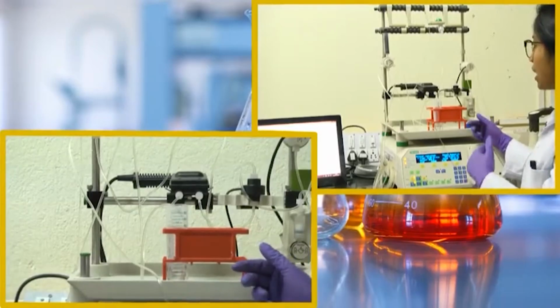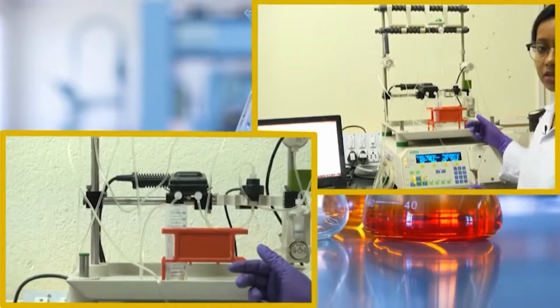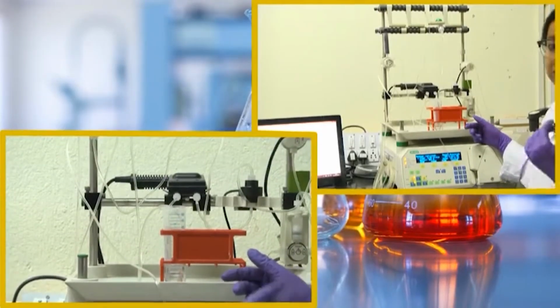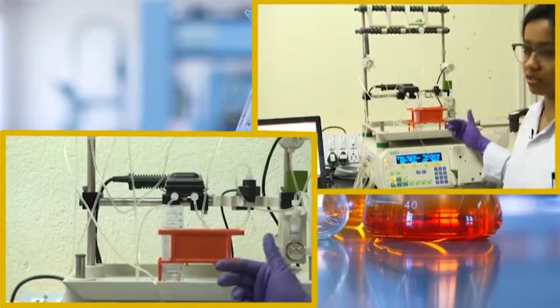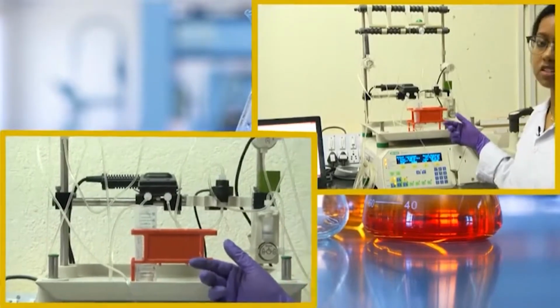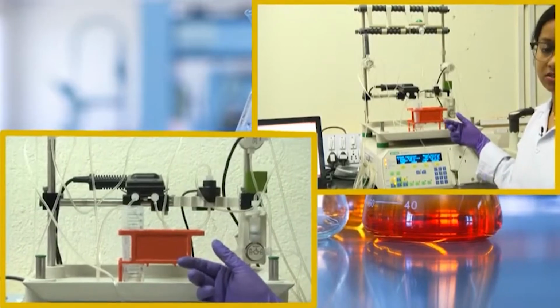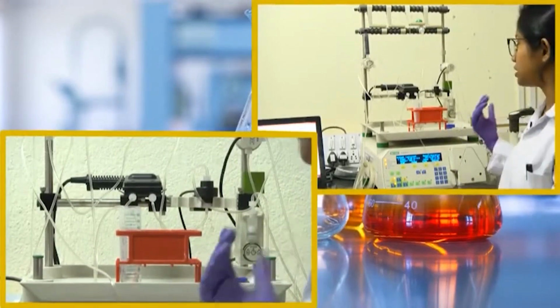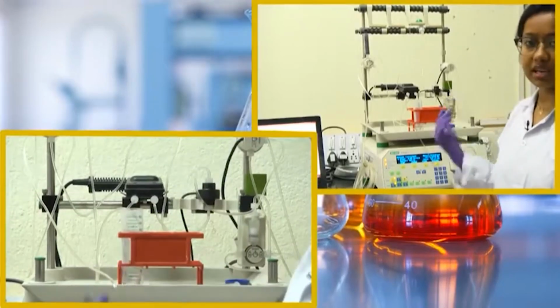So, basically right now we are washing our column using this wash buffer. If you are doing it for the first time, take the wash solution and keep it separately, and while running an SDS-PAGE, also run this wash solution, because you need to ensure that your protein is not coming out at this stage. It should stay inside the column.